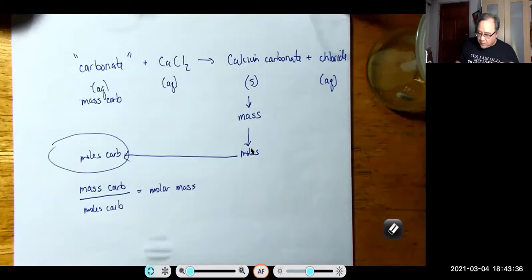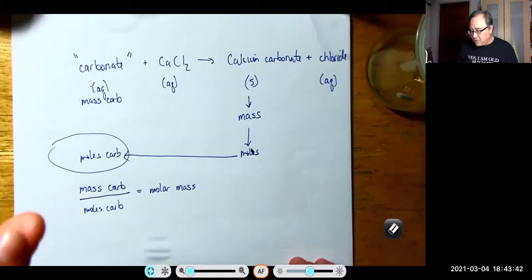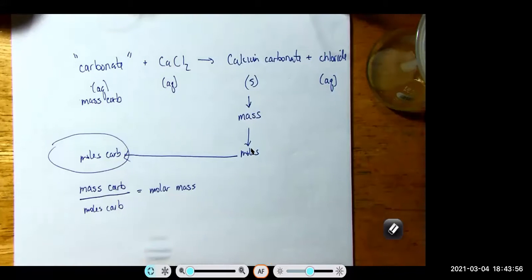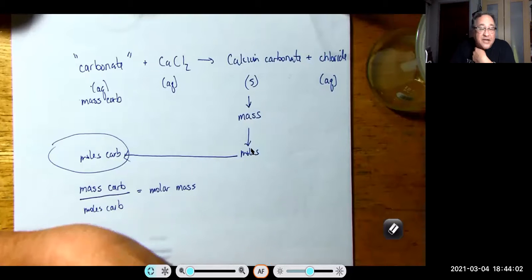A lot of people worry that when they filter, the filtrate comes out a touch cloudy. And what I tell people about that is, if it's a touch cloudy, what you can always do is take a beaker, weigh it without anything in it, put that stuff in the beaker and dry it completely, and weigh the beaker afterwards to find out whether that cloudy material has substantial mass.